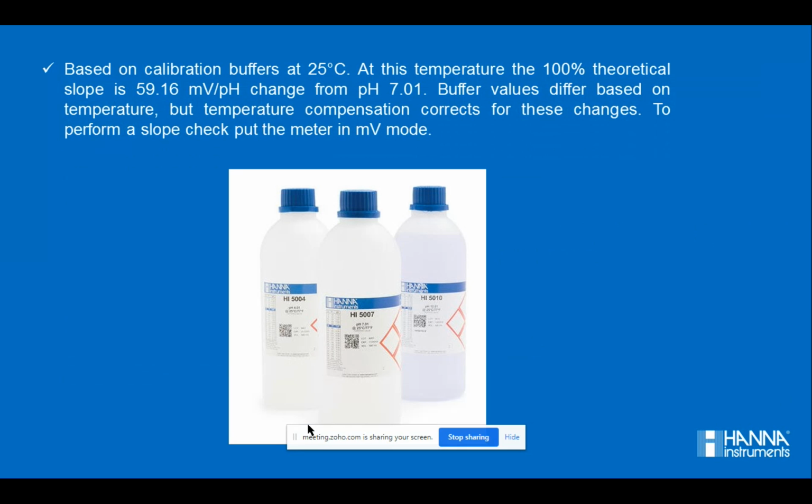Not only slope values but also offset values. If you have high offset values like 30 or 40 millivolts, you have to either clean your electrode or replace your buffer. If your electrode is taking a high amount of time to get calibrated and your meter is not accepting the calibration, then at this time you have to change either your buffers or your electrode.